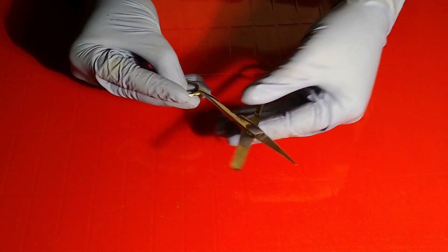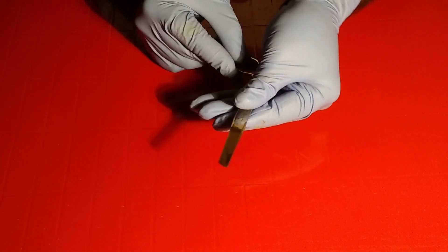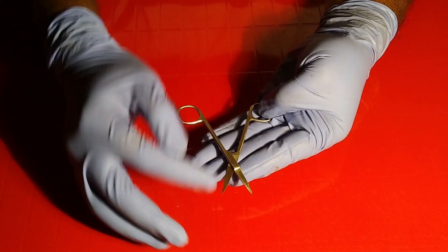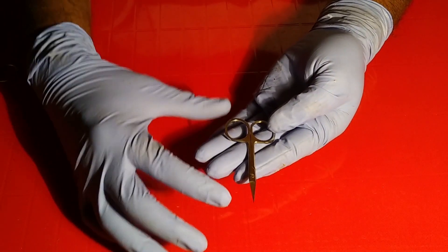Look at the tip area — it is very blunt and slanting, so while performing dissection, visceral organ structures will not be damaged. This one is the invertebrate scissor, which is very sharp and pointed. It is also used for very minute practicals.